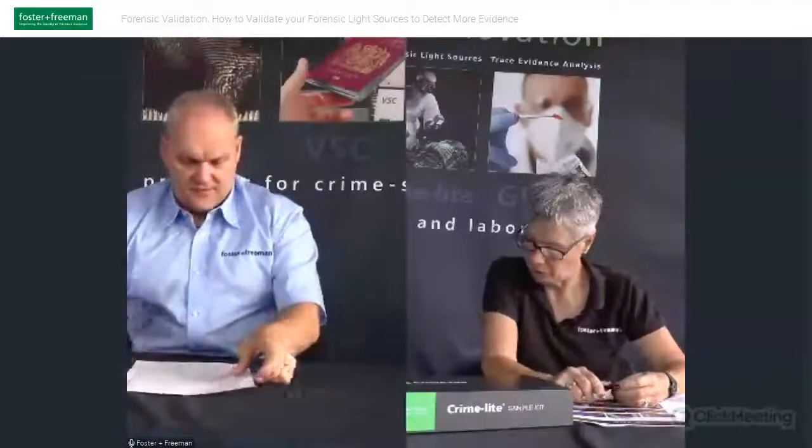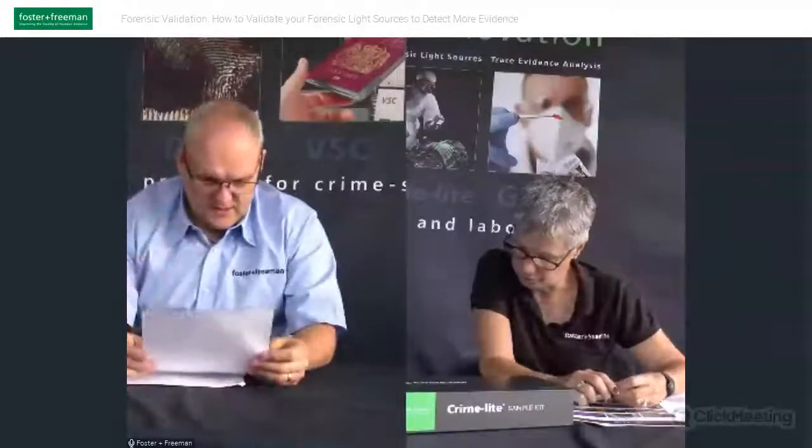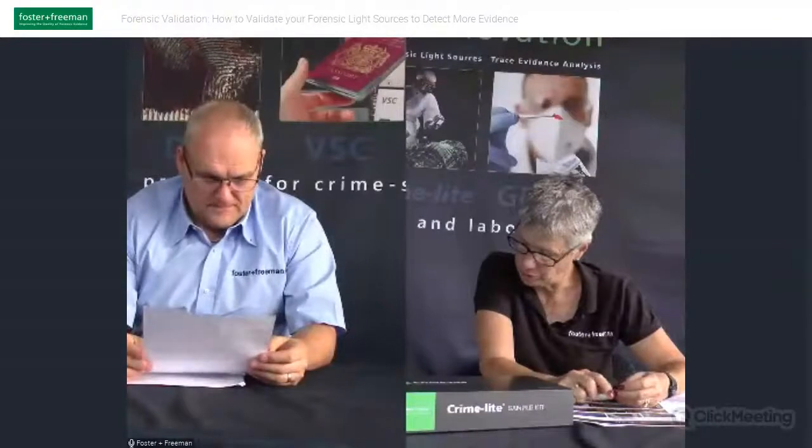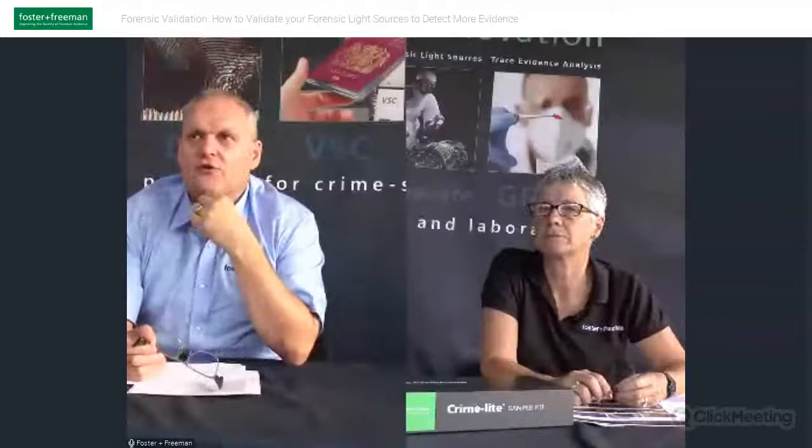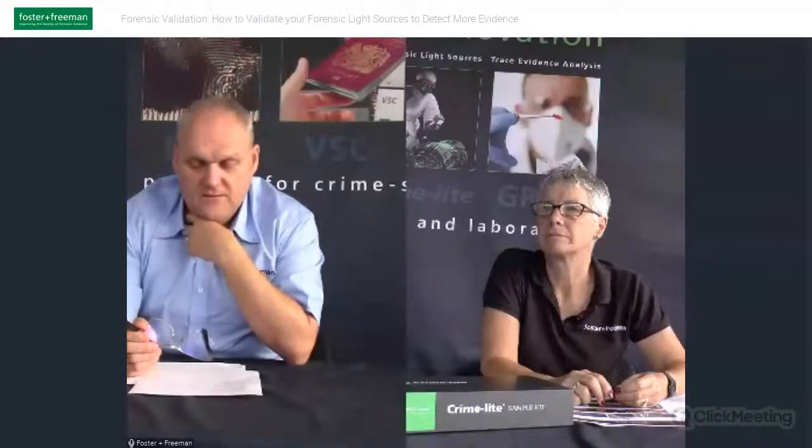Lovely. Now, the other question you were going to answer, Richard, was the preferred illumination system. Is it LED or metal halide? Yeah. I think it means halide. Yeah, metal halide, yeah. So over time, I mean, forensic light sources have been around now for in excess of 40 years. Certainly Foster&Freeman, we've been making them for almost 30 years. And so technology's evolved over that time. So in the original light sources, there were metal halide or xenon lamps.